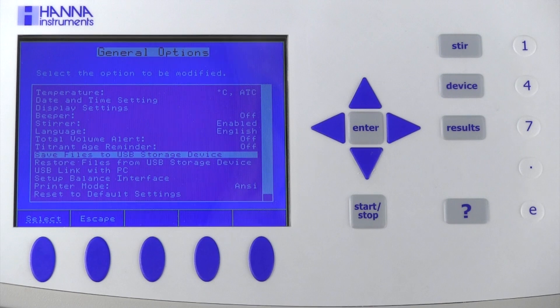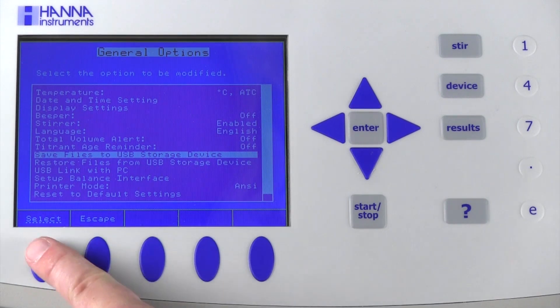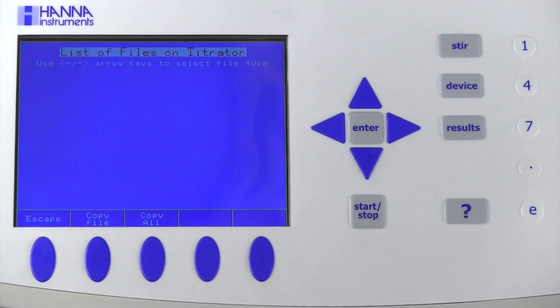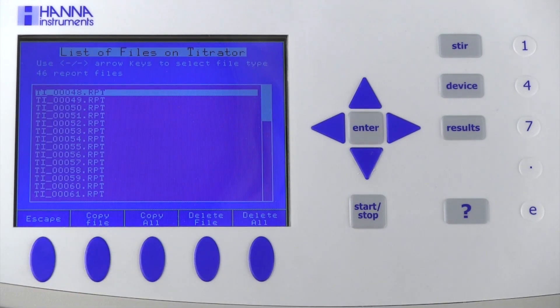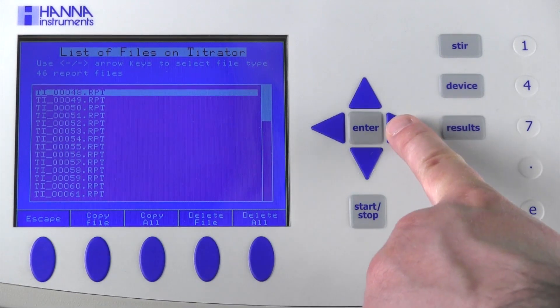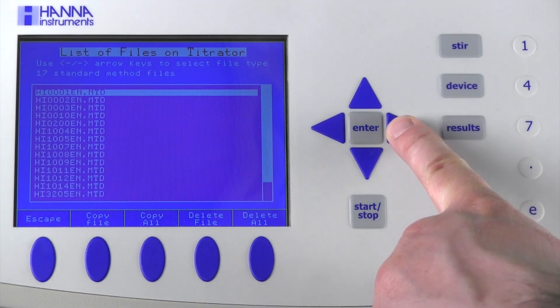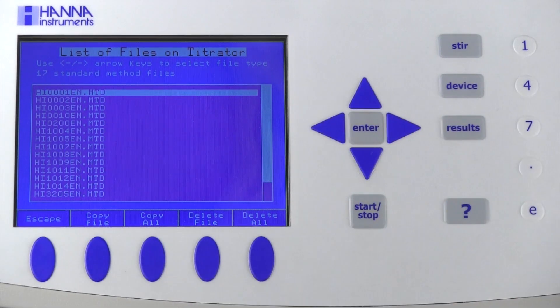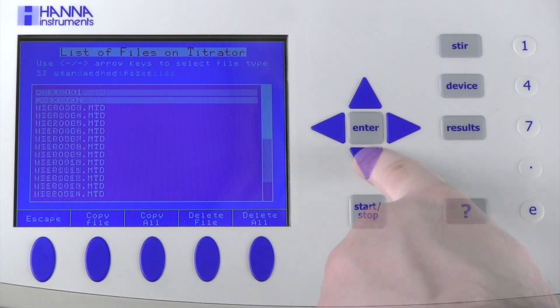The first screen displays all of the reports located on the titrator. Use the side arrow keys to toggle to HANA Standard Methods or User Methods.